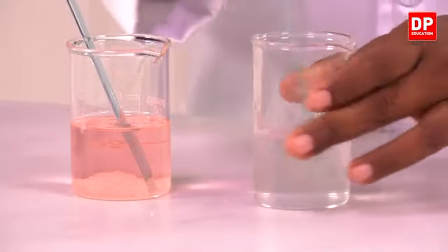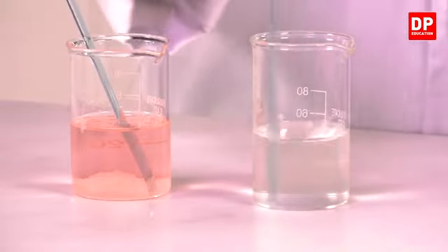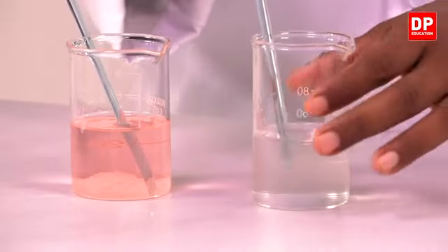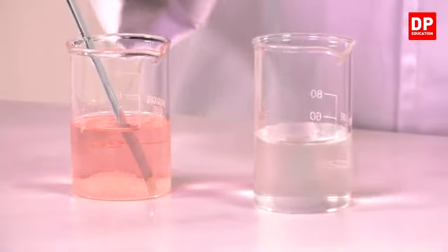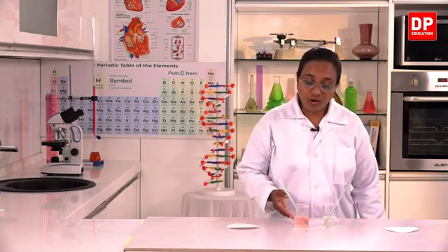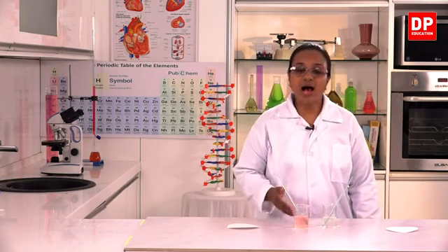A little bit more sugar is there. Yes. So now the sugar has completely dissolved in water. Okay students, you can see here the 5 grams of sugar has dissolved completely in water, but almost the 5 grams of sugar still remains undissolved in kerosene.